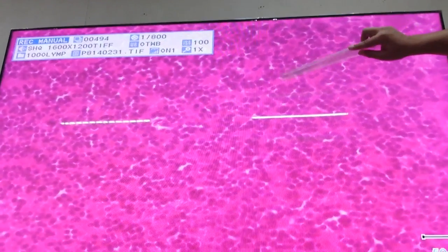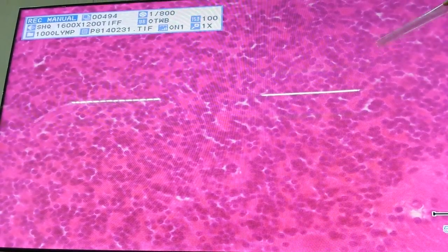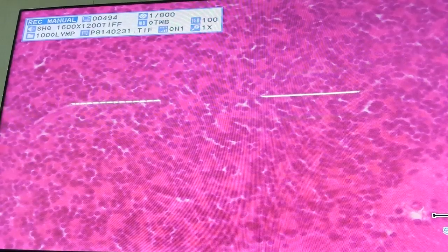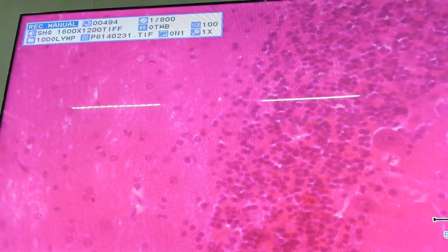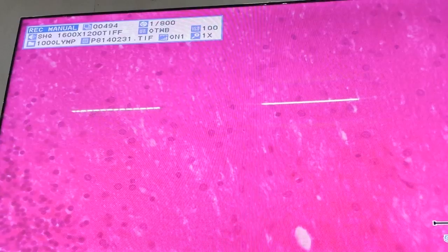And then you have pink spaces there, which would be called the glomeruli, containing the synaptic complexes. You can see occasional larger cells with vesicular nucleus. This would be the Golgi type 2 cells. And then here you have the white matter containing the myelinated axons as well as the glial cells, referring to the supporting cells.